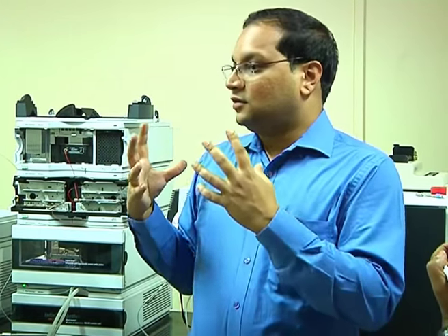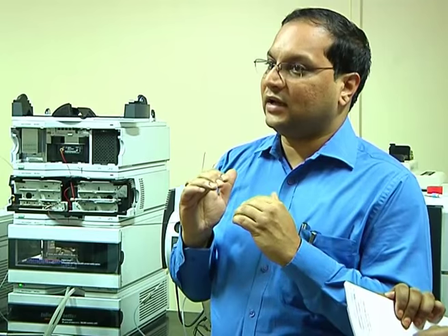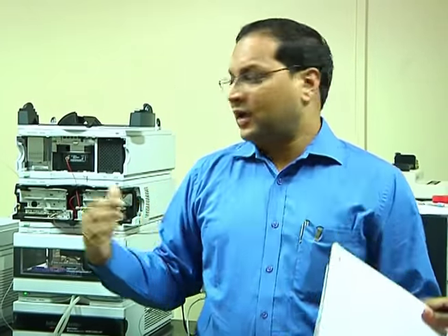And I know the basis of mass spectrometry is what? I need charge, mass to charge. Unless my analyte is ionized, the MS is blind, it cannot see. So the prerequisite of an MS analysis is that your analyte must get charged. In electrospray ionization, typically your analytes get ionized in solution, meaning in the solution itself it gets protonated, and ESI generally facilitates the ionization. It creates an environment where your ions move into the MS suitably.